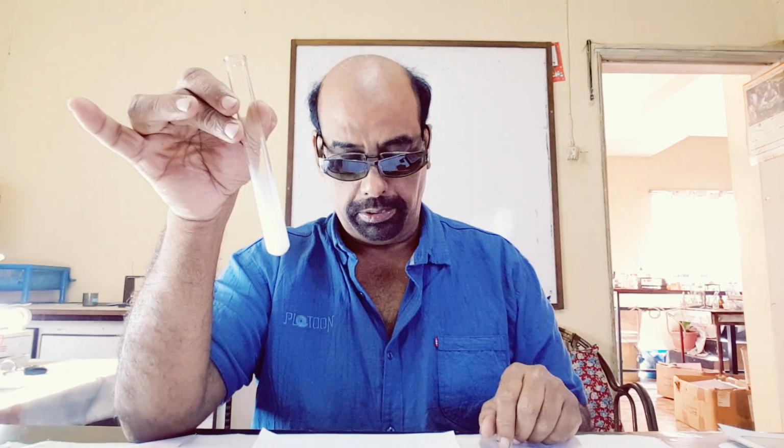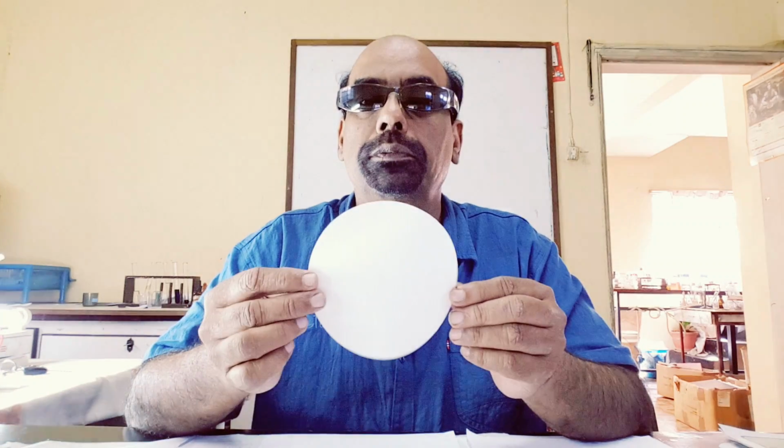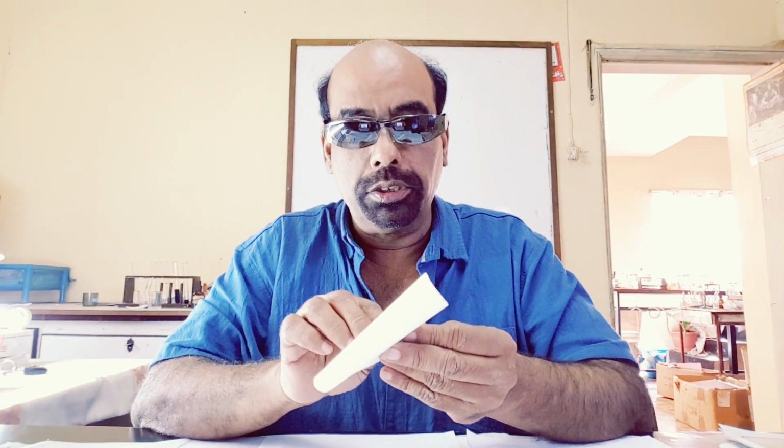The precipitate can be obtained as a separated solid by filtration, a technique used to separate. We take a filter paper, we fold it in half, then in quarter.